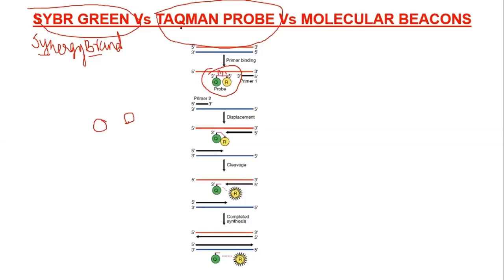and we design this probe and give it to the company, and the company takes this target as the probe and attaches 2 molecules. That is Q for quencher and R for reporter. Reporter is nothing but a fluorophore, a fluorescent molecule which can give out fluorescence. And this fluorescence can be quenched easily by another molecule which is very next to it. So that is called the quencher. So when quencher and reporter are in very near proximity, then you won't see any fluorescence signal coming out of those 2 molecules. So then how can we use this as the dye?